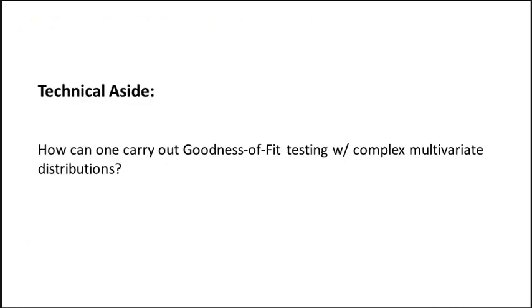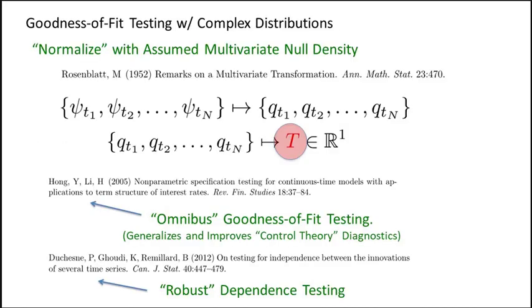In terms of time, since we waited a little bit, I'm going to go through this really quickly, but if anybody's interested in the details, I'd be more than happy to talk about it. But the idea is you have a complex distribution of points in your PDF. So if you have your baseline condition, those embeddings are spatially correlated. They're not independent dimensions in the raw dimensions. The advantage of estimating the PDF, going through the trouble of that, is once you have a PDF, you can then introduce new transformations that make hypothesis testing easier. And that's the bottom line.